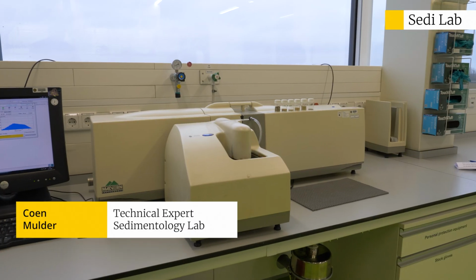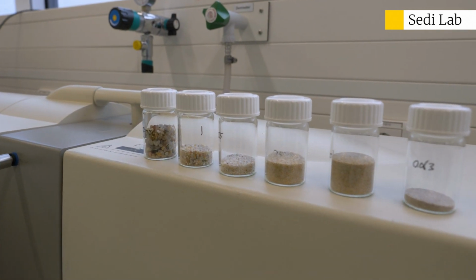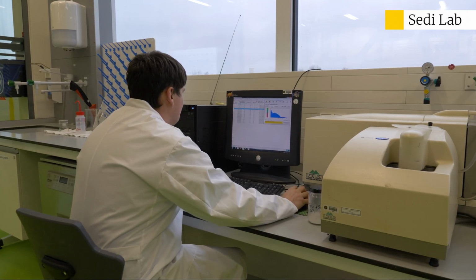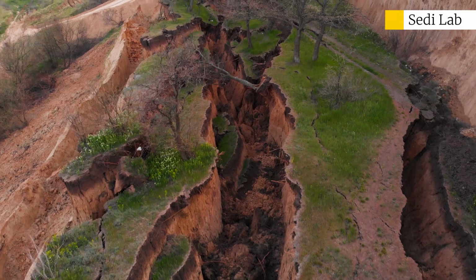With the laser diffraction particle size analyzer, we use the laser to measure particle size distribution in soils and sediments. The laser is bent by diffraction at different angles depending on the size of the particles. Thus, from that angle, we can calculate the size of the particles. Particle distribution can be used, for example, to predict soil stability or liquid behavior in soils.